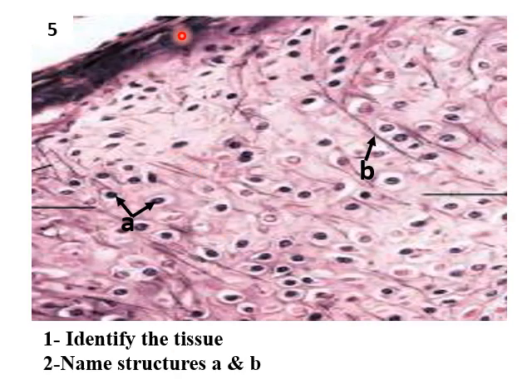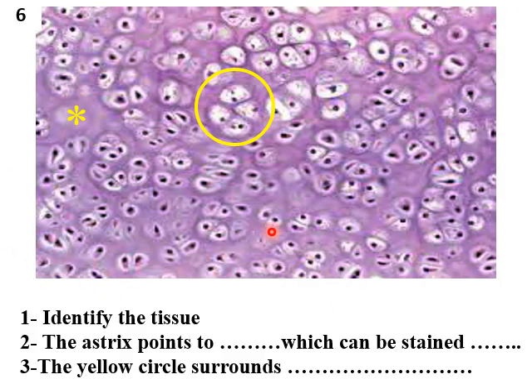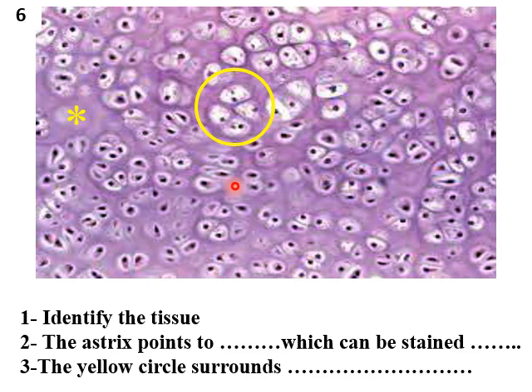Here is yellow elastic cartilage — perichondrium, chondrocytes, and elastic fibers. Another example: this is hyaline cartilage because the matrix is abundant, appears basophilic, fibers cannot be seen, and the cell nest is formed of four cells. The matrix stained with metachromatic stain changes to a different chromatic color — this term was heard before in connective tissue when discussing mast cells.